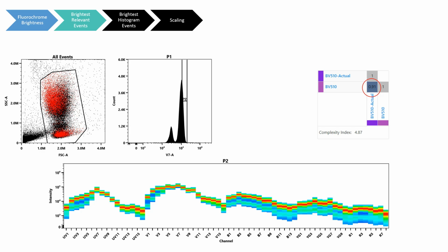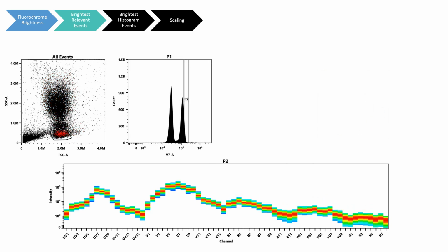It is impossible to gate on mere fluorescence alone here. Therefore, it is essential that you have your sample on scale in scatter so you can change the scatter gate to only include the relevant events, i.e. the lymphocytes. If we do this, and look at the similarity matrix now, you can see that they match.